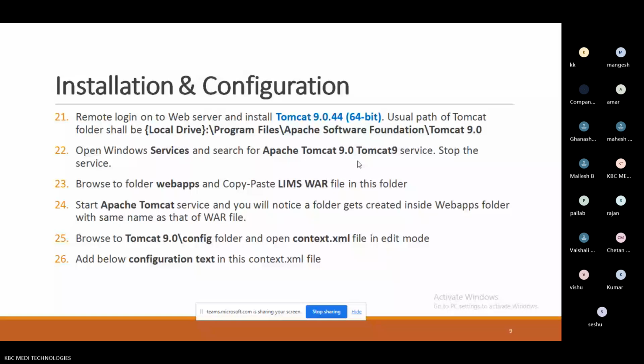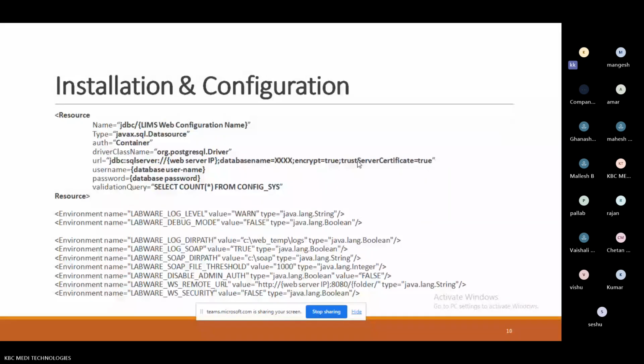Okay. Apart from this, when we discuss it briefly, I am going to deliver some additional information which is purely related to configuration. Here I have given some scripts. Maybe this is purely related to your installation part. So whenever I discuss detailed information, at that time I will tell you.